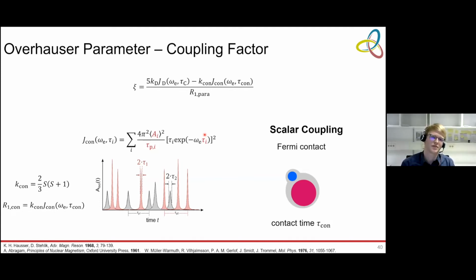If you change the viscosity of the medium, I'm not sure if you then change the tau, the duration of the collision. It could be, because if it's a lower viscosity, then it stays longer in the vicinity. It could be. I have no information if there has been a study about it, so I cannot say for sure.